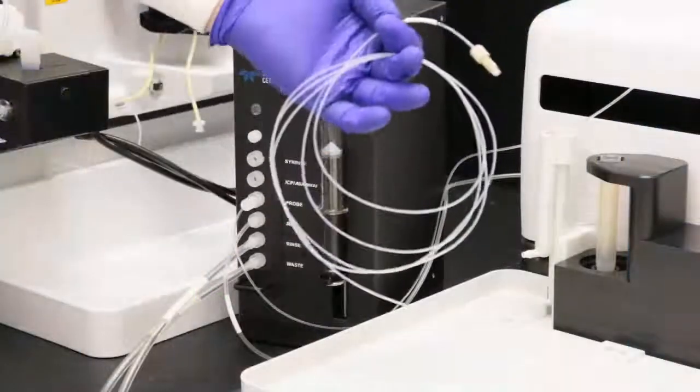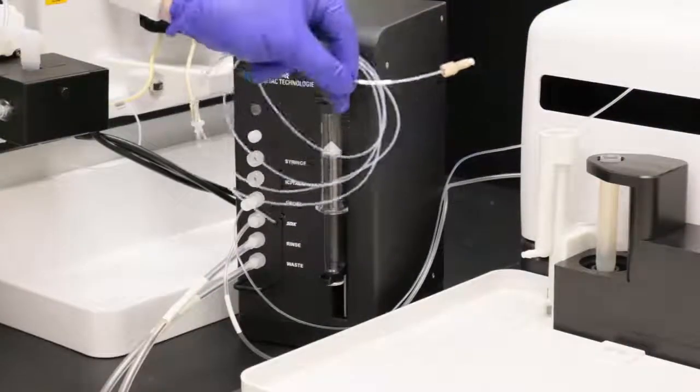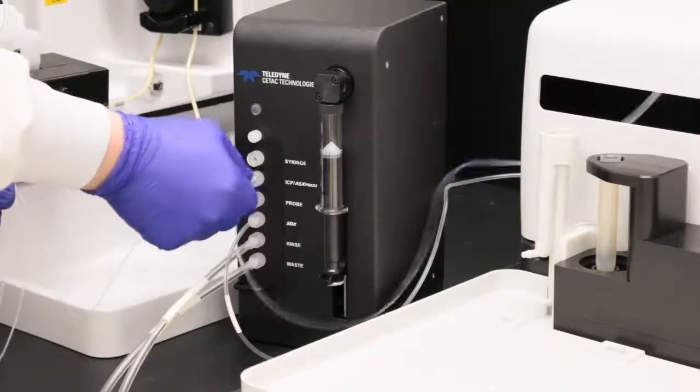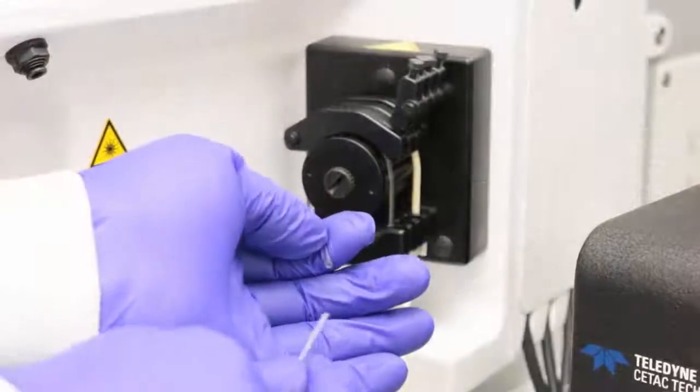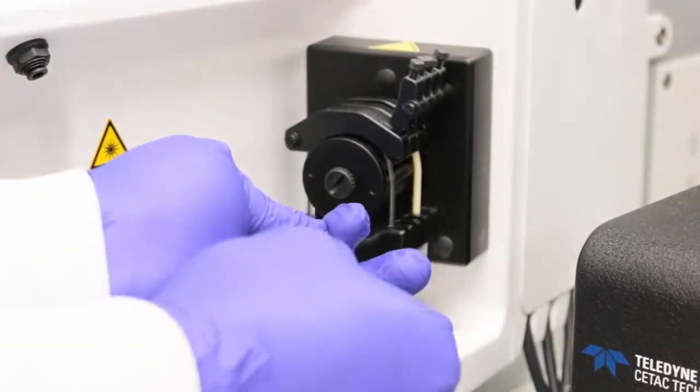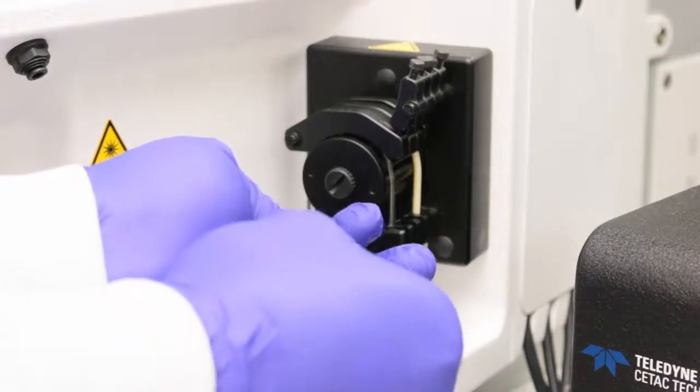Connect the ICP tube to the ICP-AS Express port. Connect the other end of the ICP tube to the sample uptake connector on the peristaltic pump of the ICP-MS or other instrument. Keep this line as short as possible.